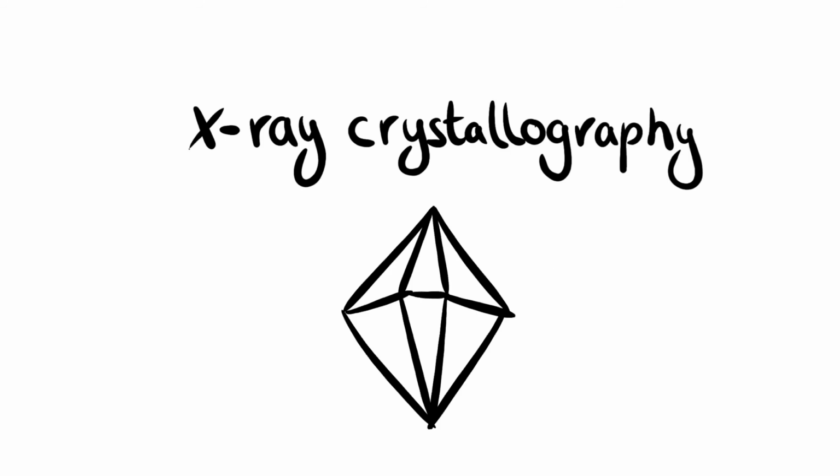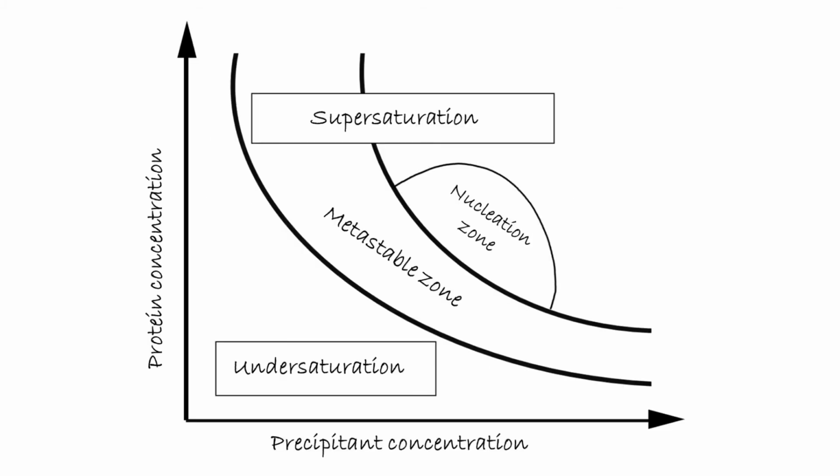And you have probably heard how protein structures are generally being solved by X-ray crystallography, which requires a well-diffracting crystal. But do you know that obtaining this crystal is still a bottleneck in the whole process? Well, today you are going to learn about it. My project is aiming for a solution to tackle this problem with experimental phase diagrams.